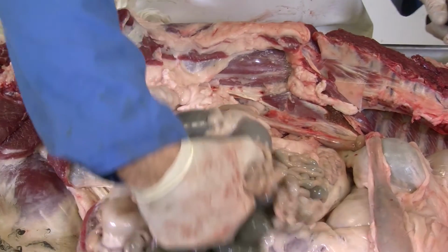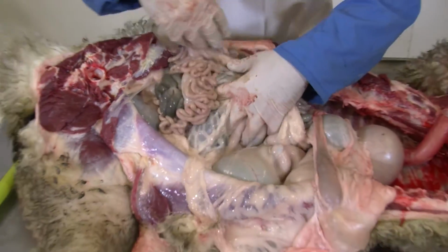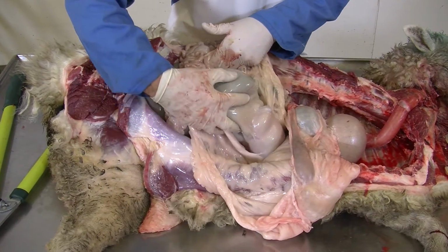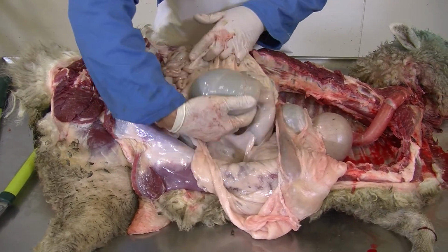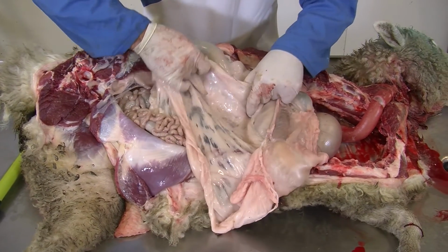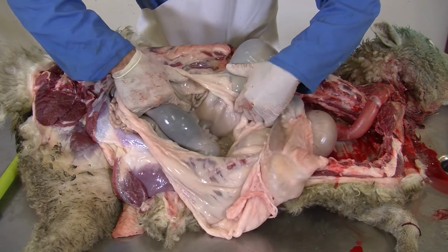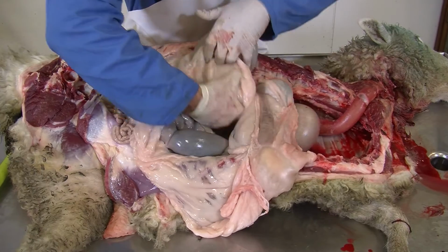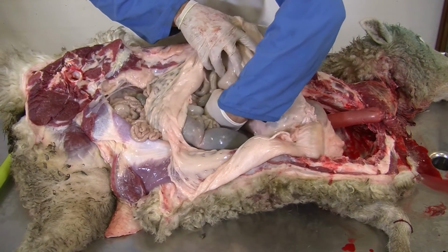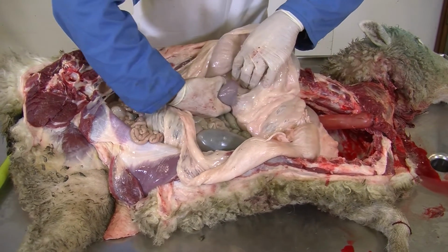Really, the other thing that we're looking for is on the other side. So move the small intestines out of the way. Here we have the rumen, and down here somewhere. There it is.